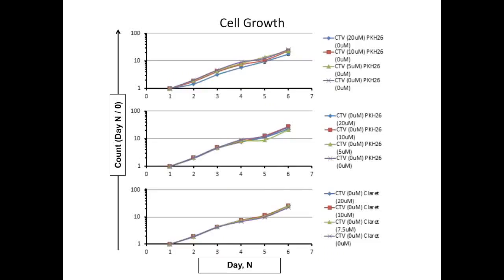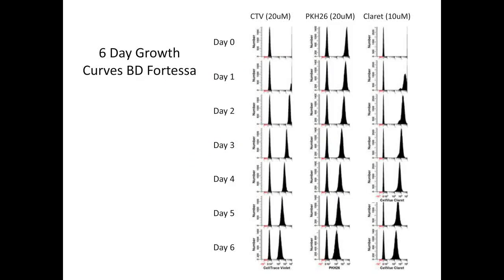Looking at just cell growth, this is days in culture, and looking at the expansion, it's a log scale on the y-axis, and you can see that these are essentially in log growth. On day 5, you can note, particularly in the middle one there, that there's a slight bump, and that's actually when the culture was changed. It was refreshed because the media was getting depleted. So we're in logarithmic growth.